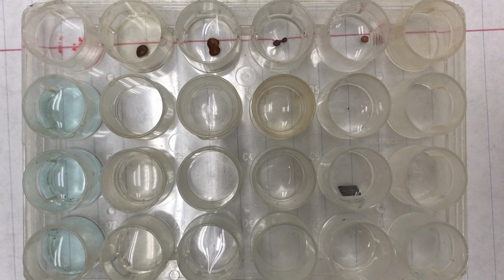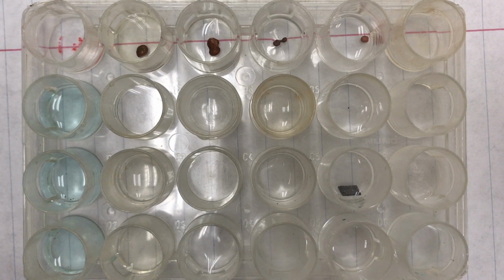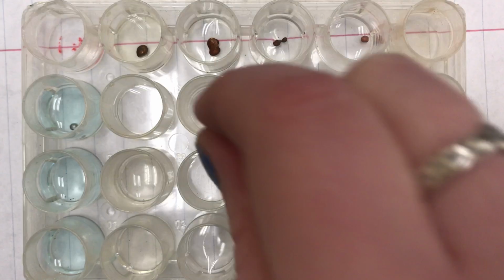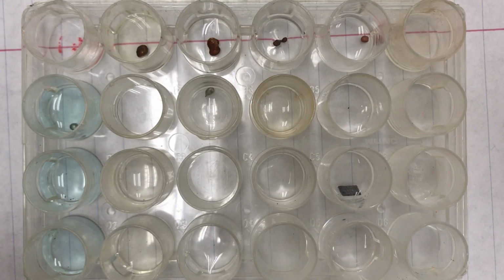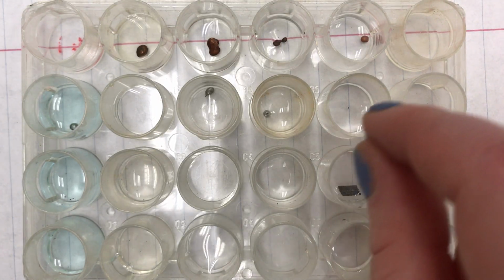So in step 5 it asked us to use iron. Instead of iron we're using tin. So on your data table you have crossed out iron and made it tin. Alright, so we're going to add 1 tin pellet to each B solution. Make note of the color and the state before any reaction happens.